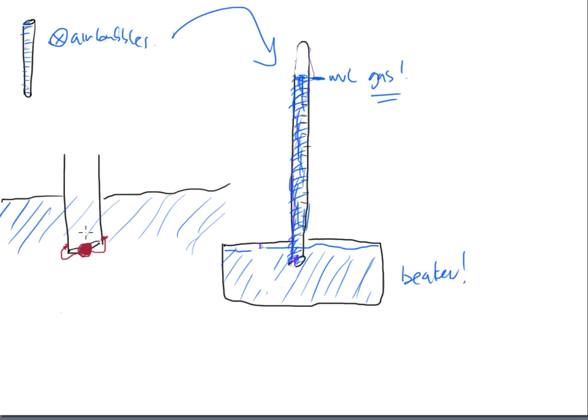And now what's going on is that we are putting that piece of metal, zinc in this case, closer to the problem area. And that problem area is the bar, and that bar is our eudiometer. So we are attaching that piece of metal right at the entrance to that eudiometer. That way a reaction is going to take place, and that reaction will generate gas as a product, and gases have nowhere to go but up.